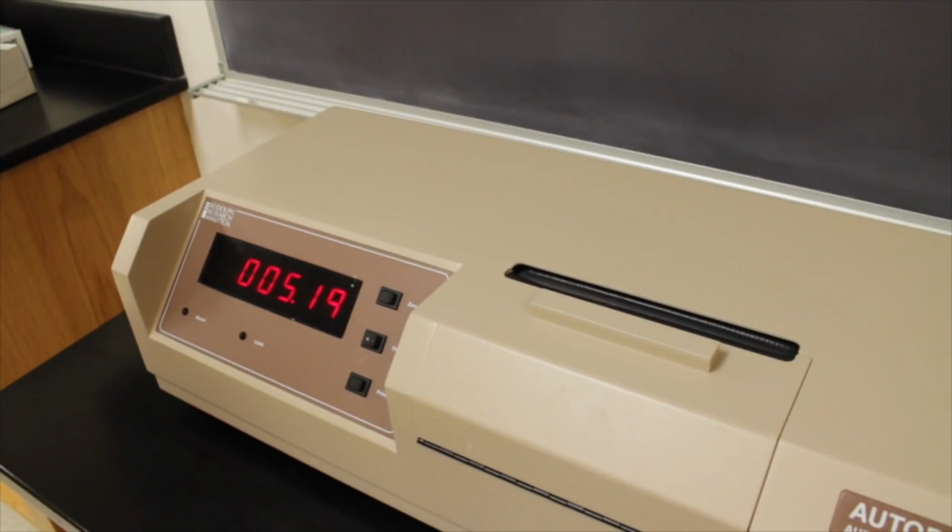Certain compounds, mostly those with chiral carbons, rotate the plane of polarized light. The angle of rotation depends linearly upon the type of sample, the concentration of an optically active component, the length of a sample tube, the wavelength of the light source, and the temperature of a sample.